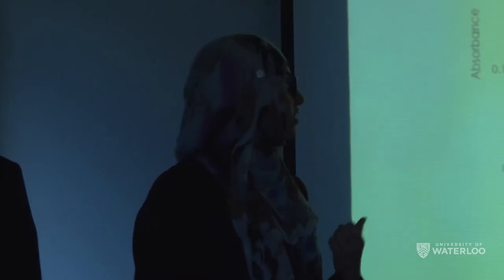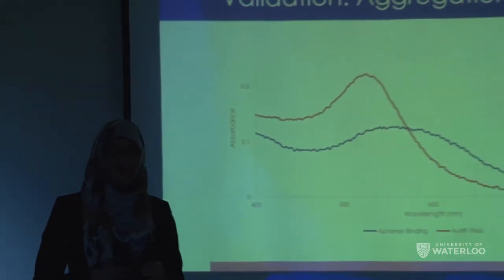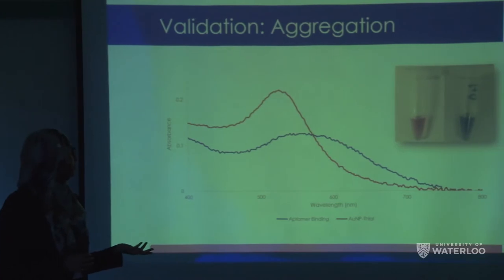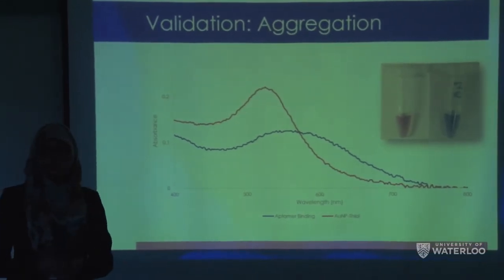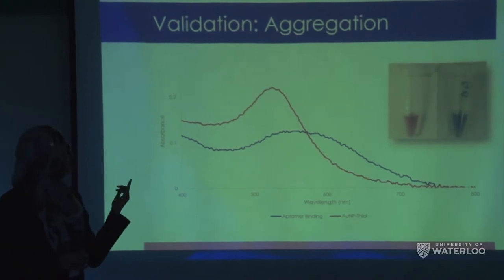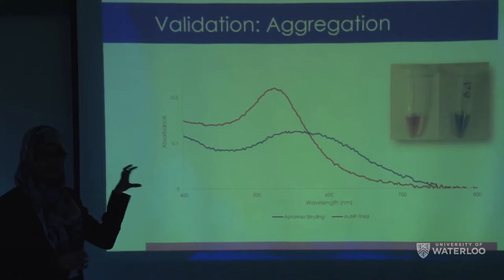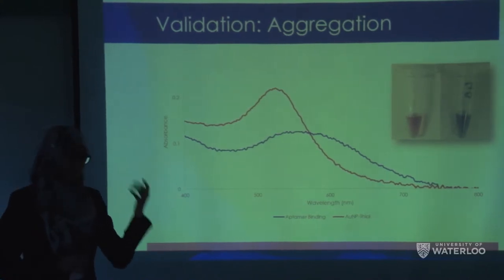So we wanted to see the shift in UV. The red spectra that you see is our gold nanoparticles, and the blue spectra is our gold nanoparticles with the aptamer conjugation, so they're actually in aggregate form. And you can see a pretty clear shift in peak to the right, as absorbance, of course, changes with the increase in the size of aggregates. In our actual experimental results, you can see in the top corner the clear color change of just the gold nanoparticles on the left, which is the red, and the aggregates on the right, the purple.